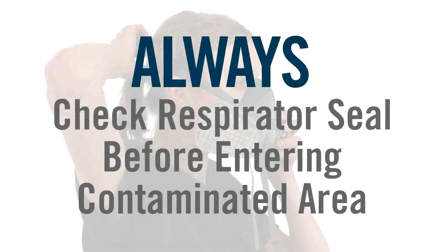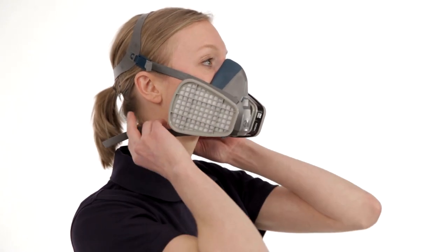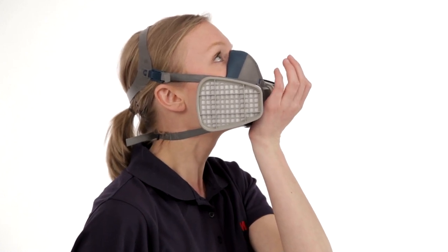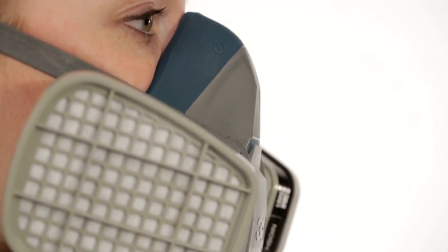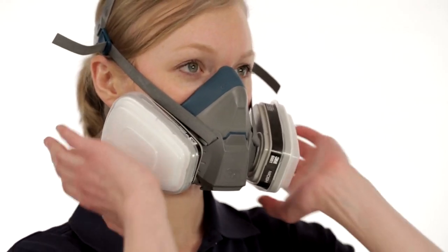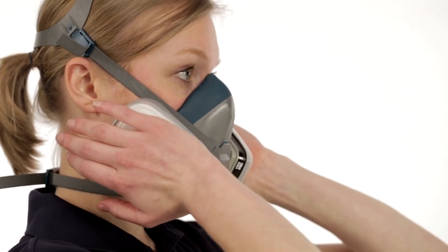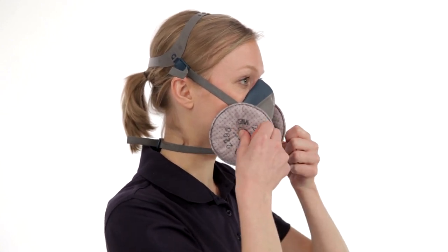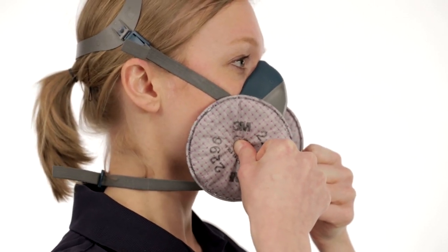Always check the seal of the respirator to your face before entering a contaminated area. You must perform either a positive or negative pressure user seal check. To perform a positive pressure user seal check, place the palm of your hand gently over the exhalation valve cover, being careful not to apply too much pressure and disturb the face seal, then exhale gently. If the facepiece bulges slightly and you feel no air leaking between your face and the face seal, your respirator has sealed properly. To perform a negative pressure user seal check with cartridges, cover the open area of the cartridge with the palms of your hands. For round 2000 or 2200 series filters, position your thumbs over the center of the filters to restrict airflow.